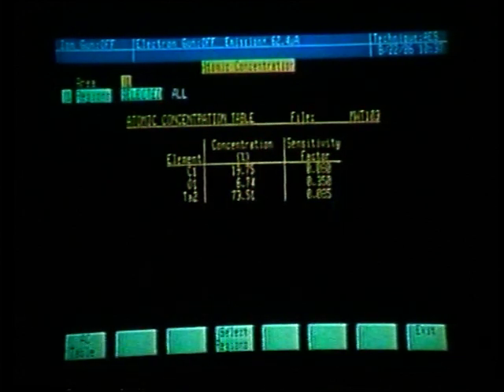To obtain a copy of this, we press the print key. Holding the control key and print gives us a copy of the graph. Since we do not have a graph, we want a copy of the analog display. And a copy of the analog display is achieved by simply pressing the print key without holding the control key. Once we have that copy, we can exit this menu.